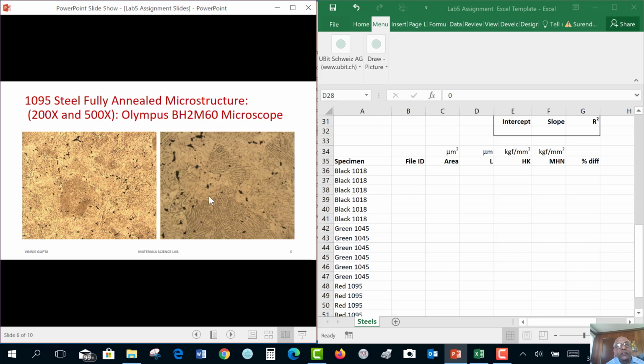These small pebbles are all pro-eutectoid cementite. So this white pebble areas. So if you can reverse the image, maybe you can measure those. So I asked you to experiment with it. Maybe you will get to learn more about the Fiji image processing.